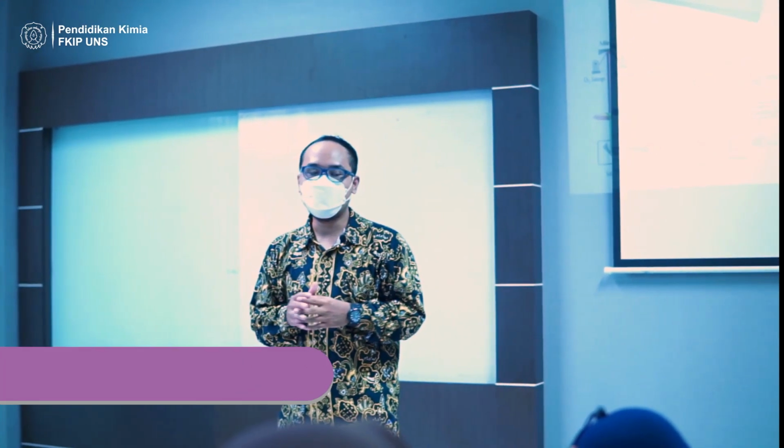So we have already understood the definition of acid and base, and we have already discussed the requirements for the compounds to display colors. And then we will try to make our own pH indicator. You are going to be teachers at school, and not all schools will provide or can afford synthetic pH indicators. Here, you will be prepared to make your own pH indicator by utilizing natural dyes.